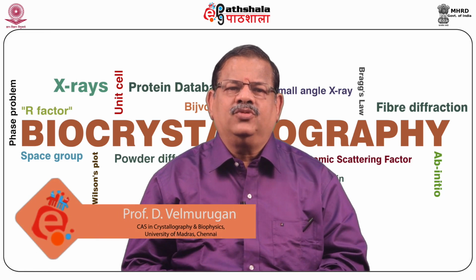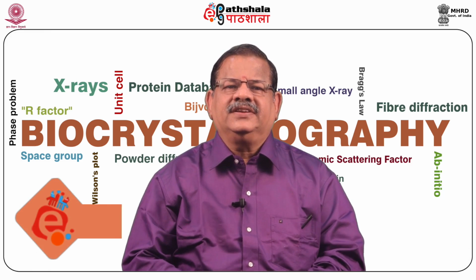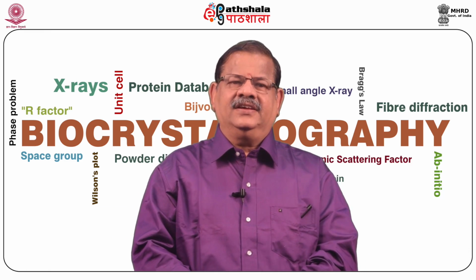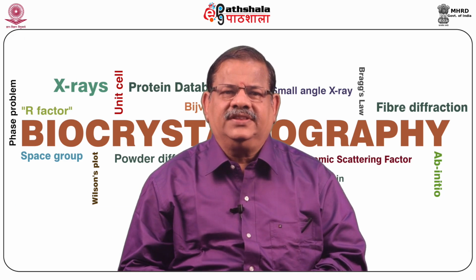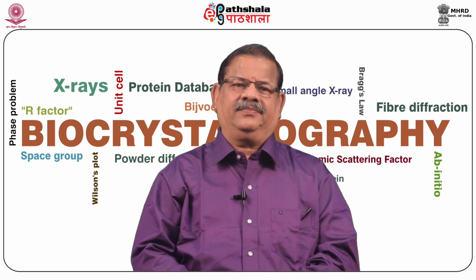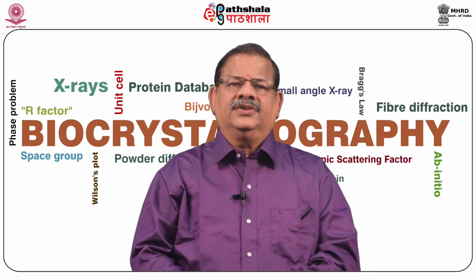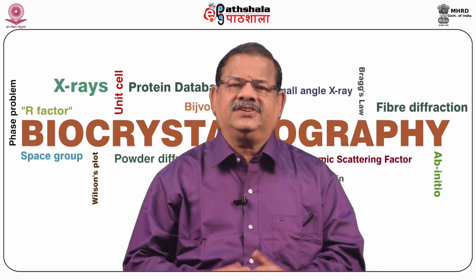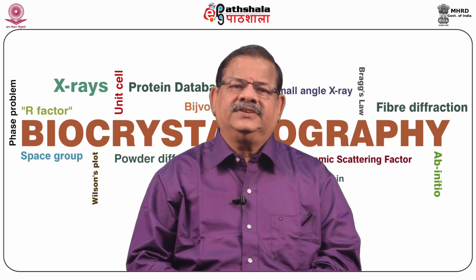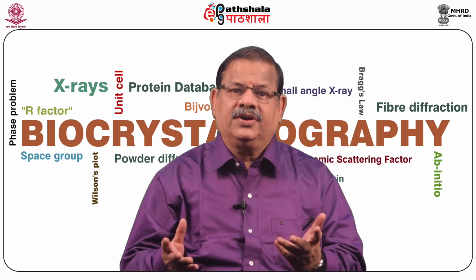I am Professor D. Velmurugan, former head of the department from Center of Advanced Study in Crystallography and Biophysics, University of Madras, Guindy Campus, Chennai, and I am at present working there as the University Grants Commission Basic Scientific Research Faculty. Today, we are going to talk on the module, some of the macromolecular structure determination programs, CCP4, Phenix suite, SHELXD and SHELXE from paper Biocrystallography.